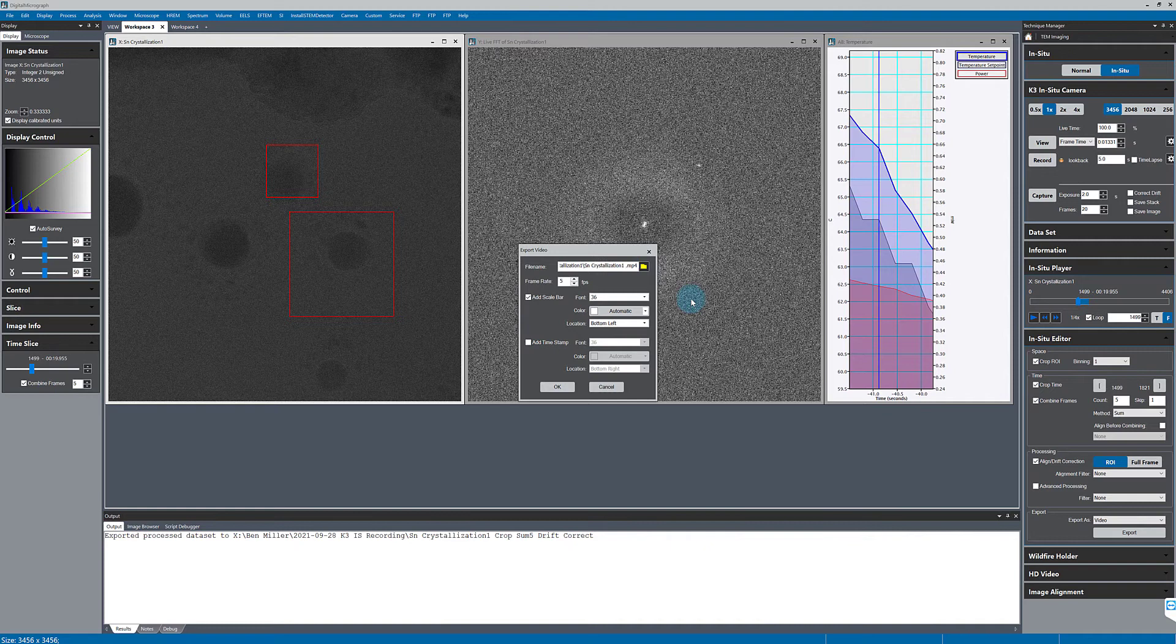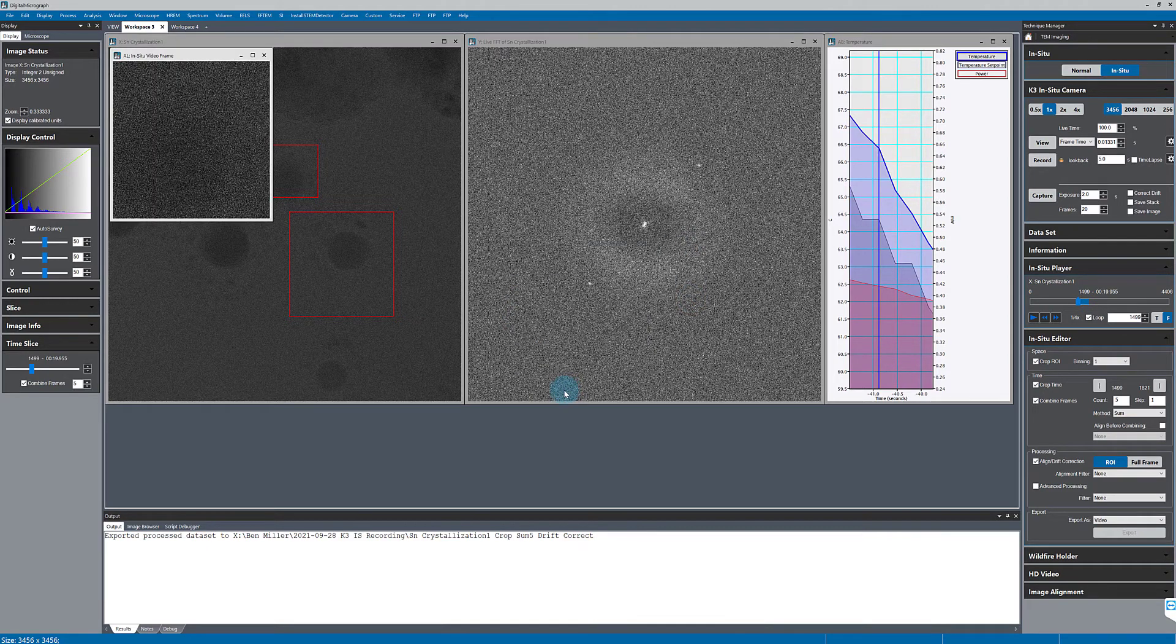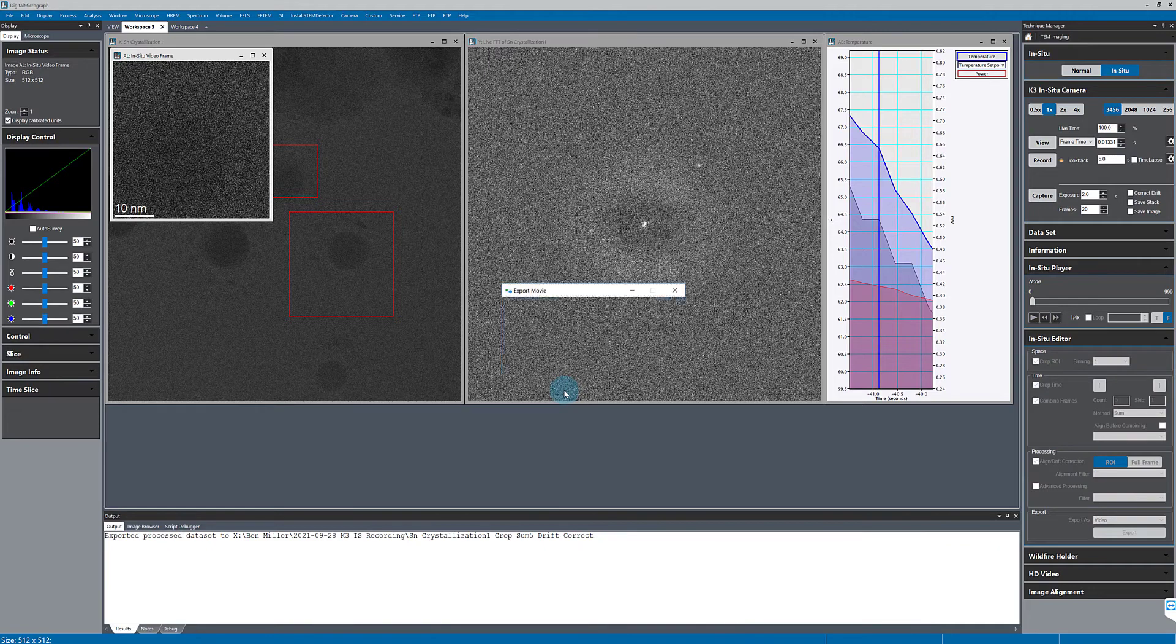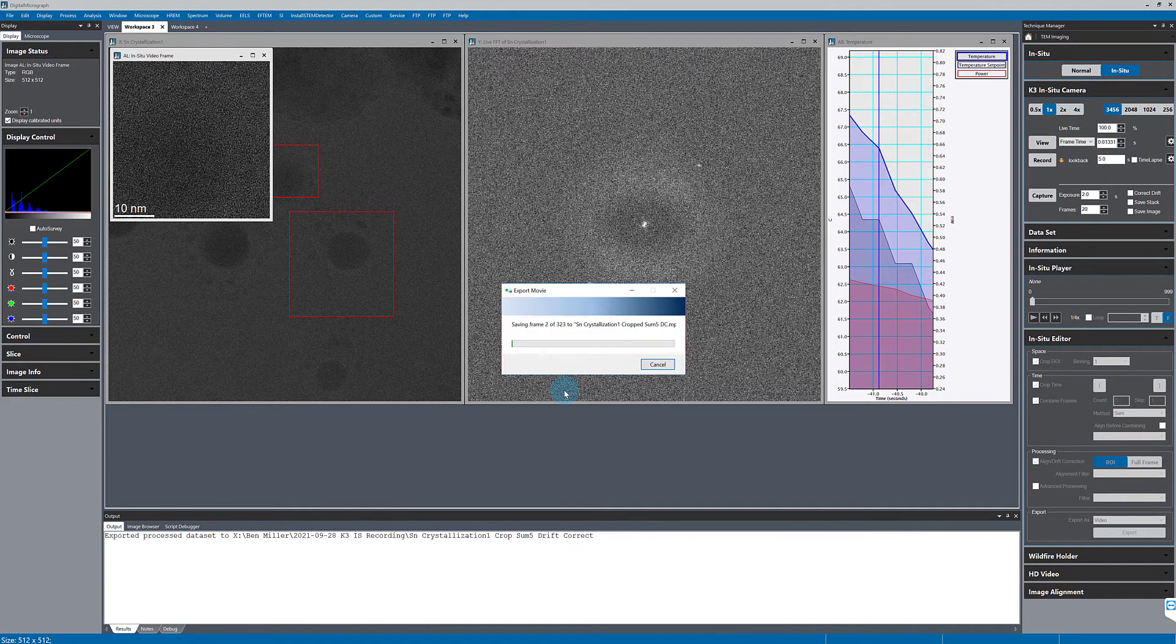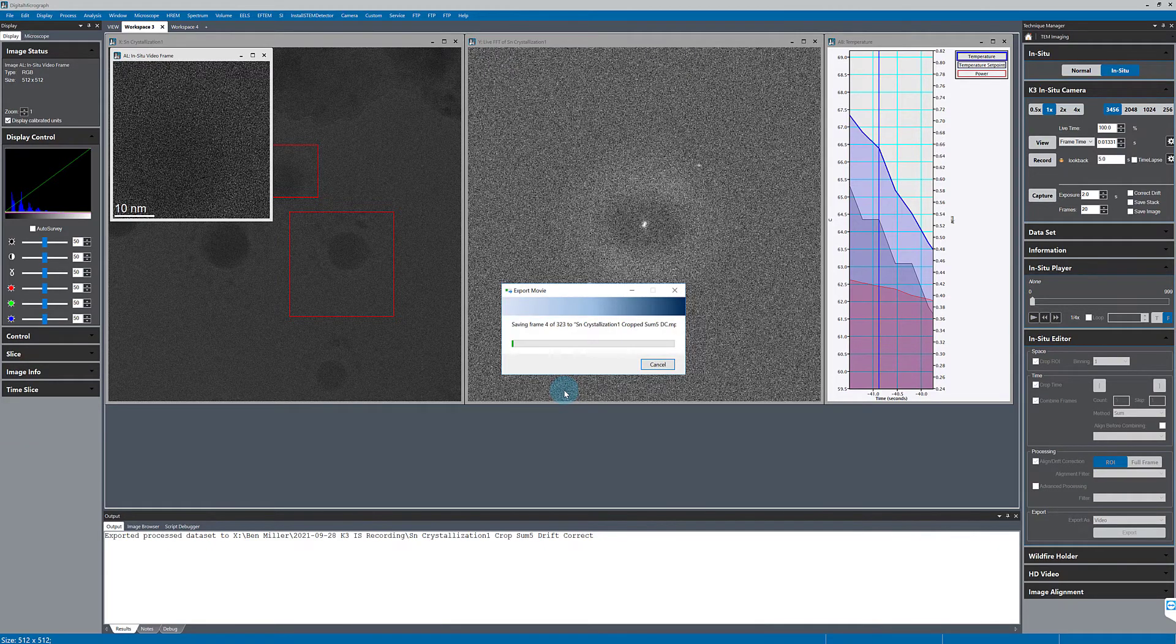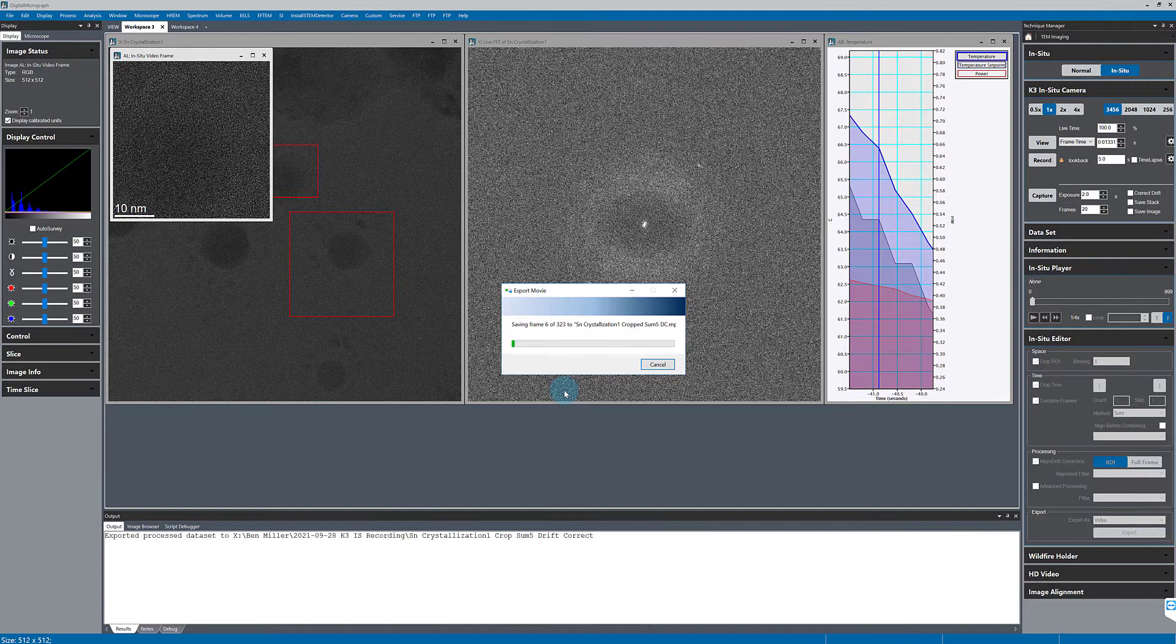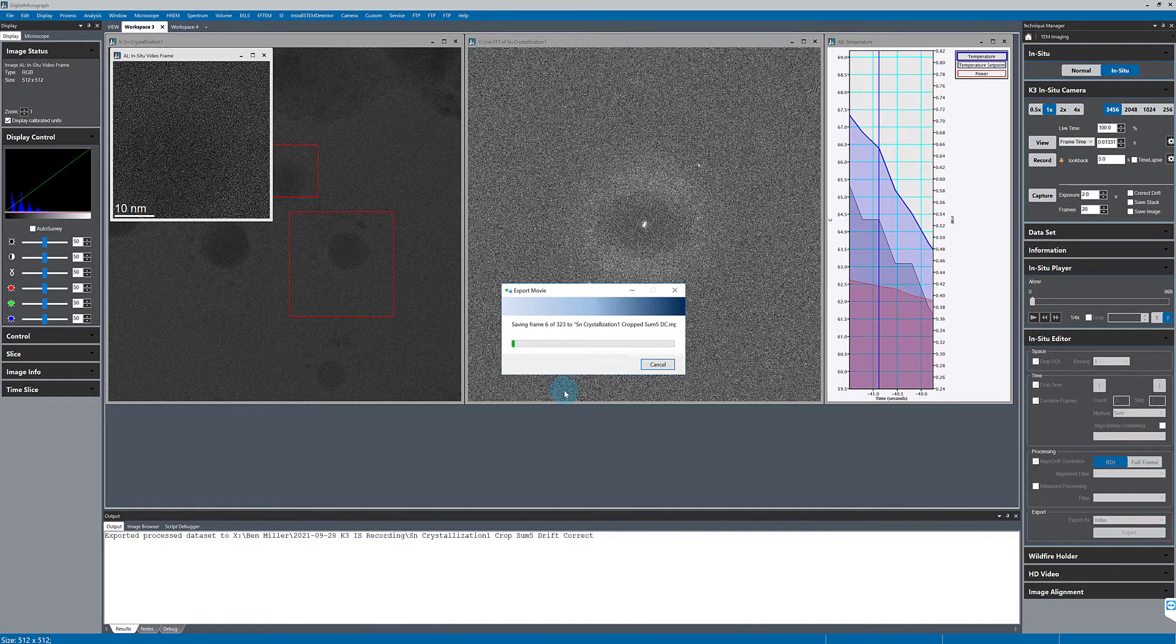I'll again give it a descriptive name and again it will go through frame by frame and save this, but this time to a compressed mp4 format. The compression here is lossy, so not all the information is retained.